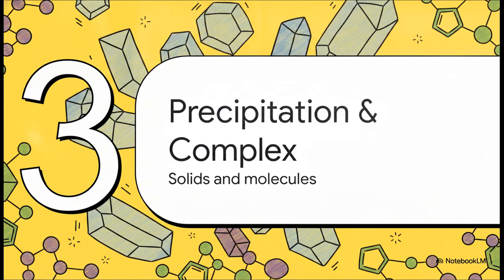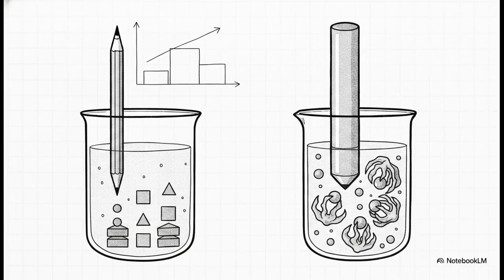All right, section 3, precipitation and complexation. Time to look at solids and molecules. Precipitation titrations are absolutely crucial for environmental and industrial halide analysis, so your chlorides, bromides, and iodides. The old-school visual methods really struggle with mixtures of these because of co-precipitation errors. It gets messy fast.